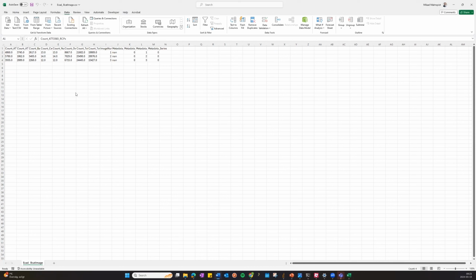If you need to, depending on whether you use Microsoft Office that recognizes dots or commas, you can convert all of them to commas or dots, as you please. So I'm just going to convert them in this case to replace all dots with the comma. Replace all.